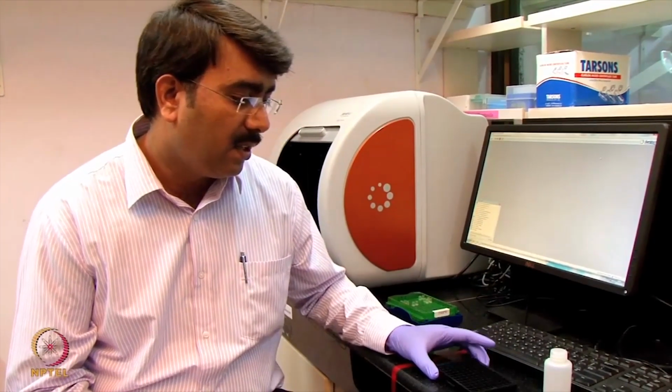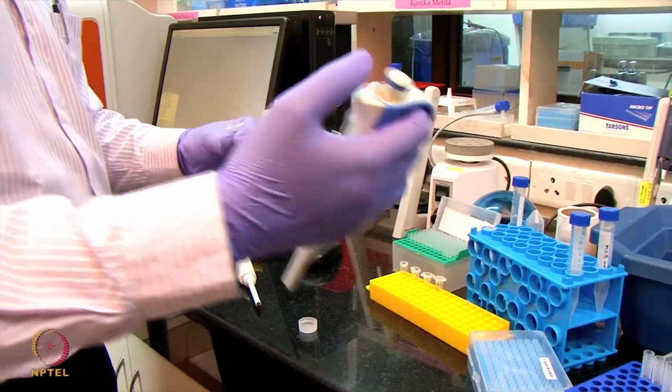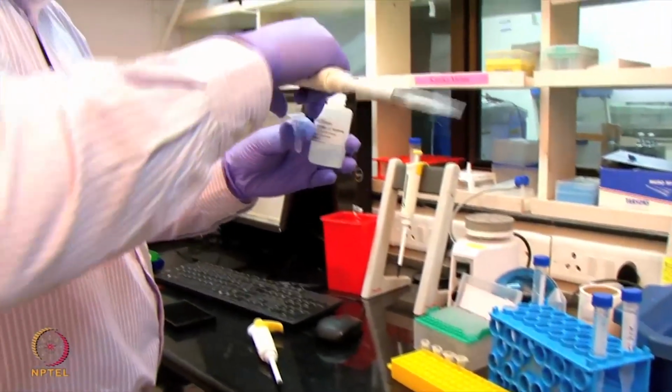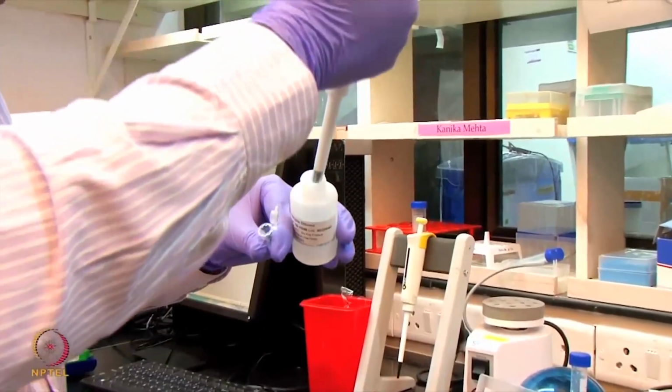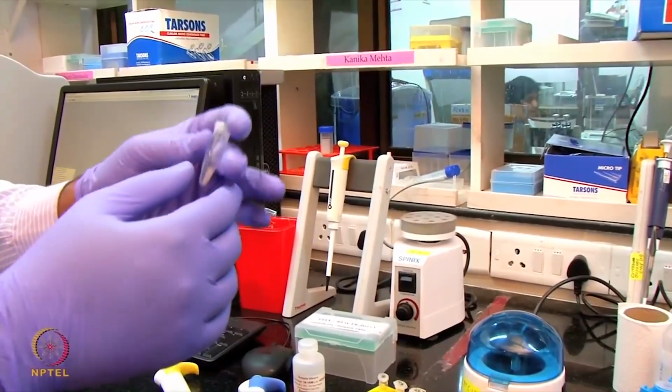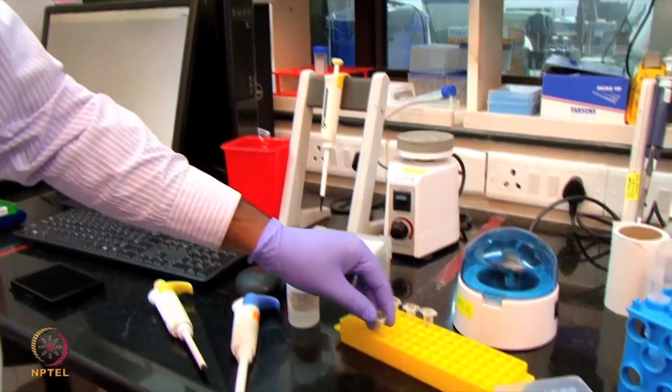We are going to do a quantitation of the apolipoprotein. In the previous step, we immobilized the biotinylated antibody onto the streptavidin sensor. Now we can do the quantitation using those sensors. It's pre-immobilized. So what I am going to do is make an apolipoprotein standard at a concentration of 50 microgram per ml. I'm going to dilute it to 50 microgram per ml using the sample diluent, and from this I'm going to do a serial two-fold dilution with the buffer.